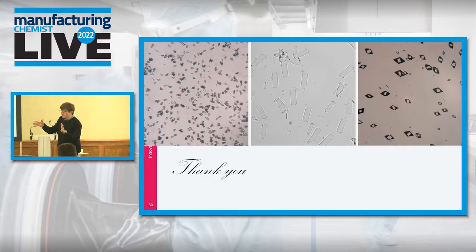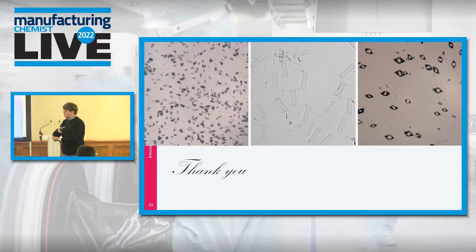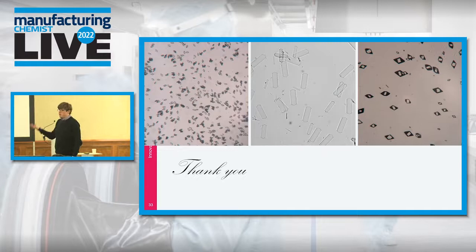Another thing is making sure that the solvent and anti-solvent are miscible. They must be mixing together, so not oil and water. They must be perfectly miscible, is one of the main things. Again, what also helps is that the more soluble your API is in the solvent, the better. We have worked with systems where we have tried to increase the API concentration in the solvent, again for industry purposes. They want to make as much product as they can. And that can be problematic. However, it can easily be solved by simply heating up the API in solvent to get full dissolution. But again, that's one of the main things, making sure they're perfectly miscible, and it all depends on the interaction with the API.